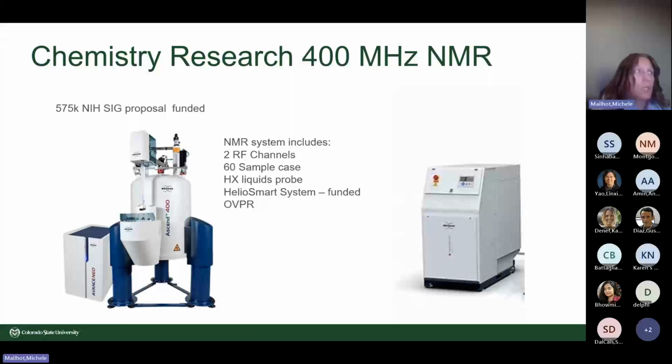So once you use it, it's gone. And as time goes on, allocations happen and you can go down to 0 allocation. So this helps us be a little bit more self-sufficient. Typically for helium recovery, you can recover 70 to 80% of the helium. So this is a good step towards getting all the NMRs on the recovery system.